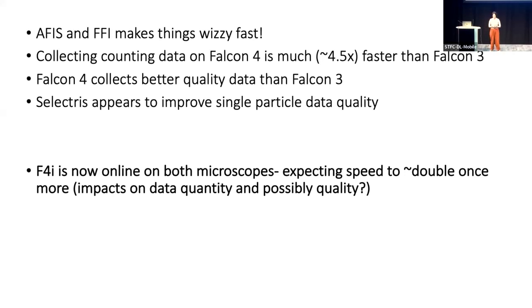We've had Falcon 4i bits sat in a box since February, but as of last week, they are now on the microscope, and we're very, very excited now to be going through and repeating this experiment with Falcon 4i data, just to see again what that does to throughput, what that does to time to a relatively decent reconstruction.